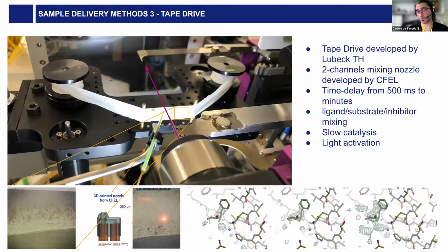And it also depends on the way we are going to perform this experiment, because you can think about having a substrate with a cage compound bound but not processing the active site. In this way, doing a pump and probe experiment, it makes a clear T0 when the reaction starts. Or you can think about doing a mixing experiment.